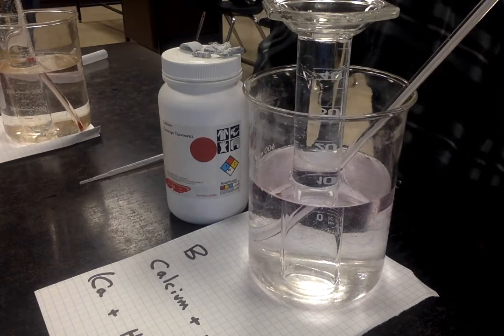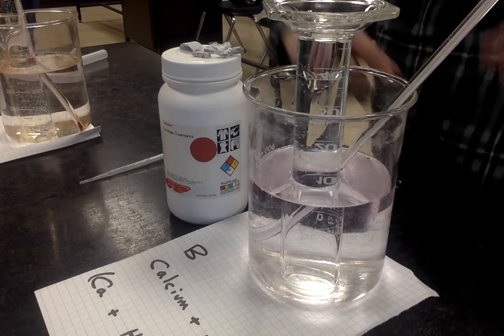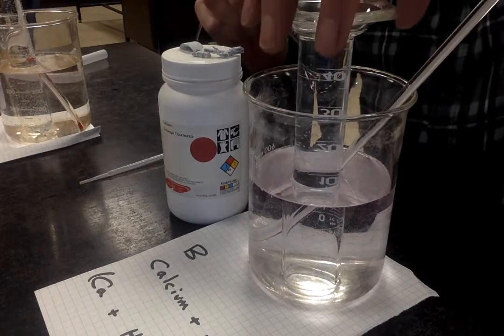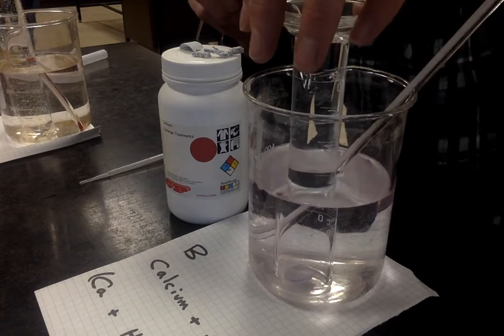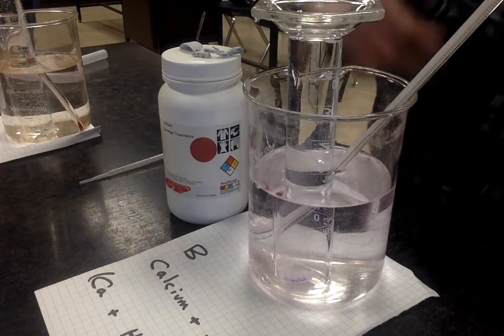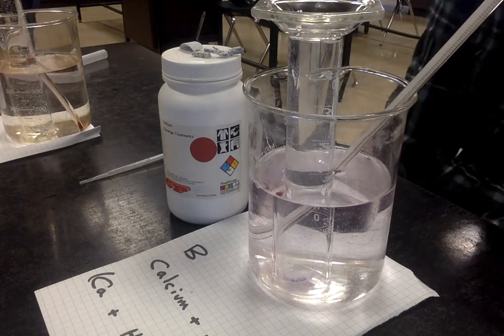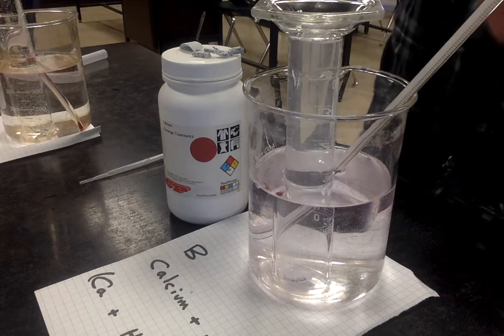That's not part of the experiment, but you might see that it will become a little bit useful and relevant later on. Hey, by the way, after 2 minutes now, there is no gas that's been created in the zinc beaker. There. I've just added the calcium to the beaker with water. Let's look for a color change and the gas produced. The time is 11:31.